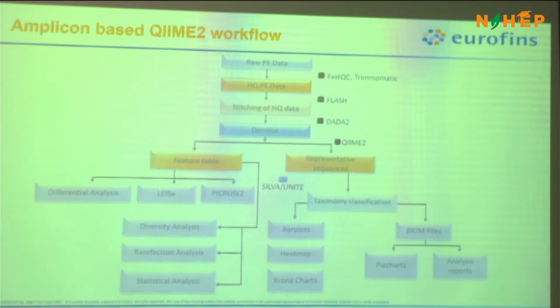So now each read has been stitched and made into an amplicon. Each amplicon will be used for identification, and each read which is getting aligned to the bacterial database will be used to calculate abundance based on the algorithm. So I am making one read as a stitched read, so that I have a full amplicon sequence of it.